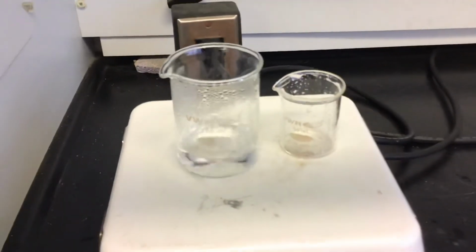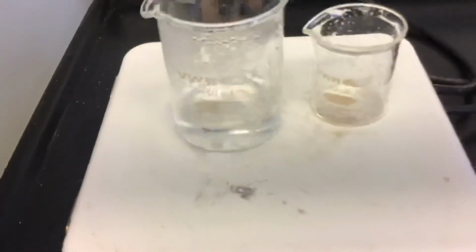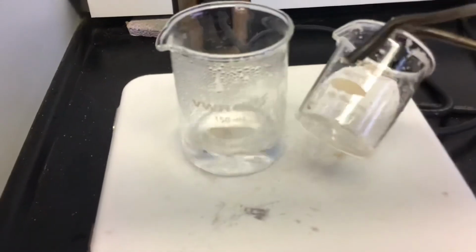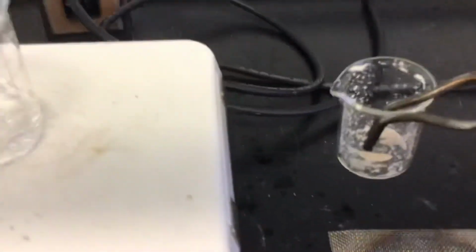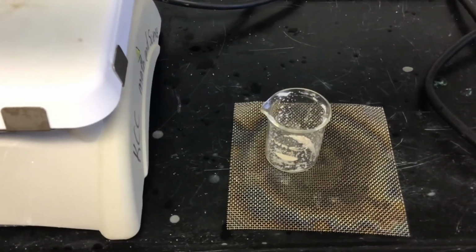Okay, so you can look at the sand one on the right, and you can see that it doesn't look like there's any condensation on that beaker. And if I was to pick it up, you see how the sand is moving freely, which also is an indication that it is no longer wet. So I'm going to take that beaker and put it on the wire gauze right here on the hook, and I'm going to let that beaker cool down. So that's going to be beaker 3 that has just the sand in it.